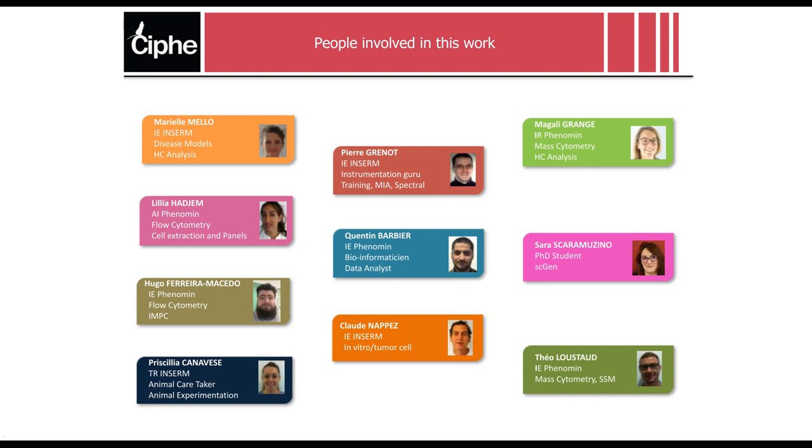And I also like the features that I have tried to highlight here about data management level, that I may have people that only come and consume visualization, some that will have rights to actually clone experiments and do their analysis on their own and edit graphics very quickly. So this is very, very nice to have, so that the work basically can be shared through this capacity across the team.